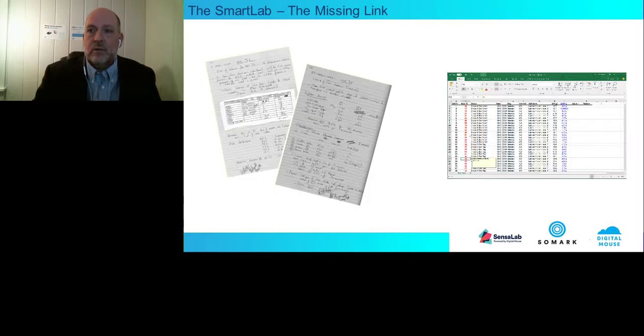The lack of reliable identification of inputs to your research is further compounded by the lack of data quality control arising from the use of paper lab notebooks and spreadsheets, manual recording of experimental data, manual input of results data. They leave the process open to human error, transcription issues, and do not provide audit trails and lack transparency.